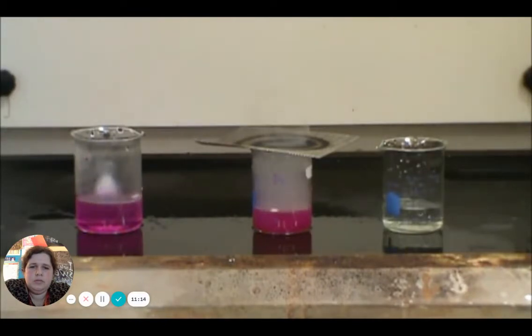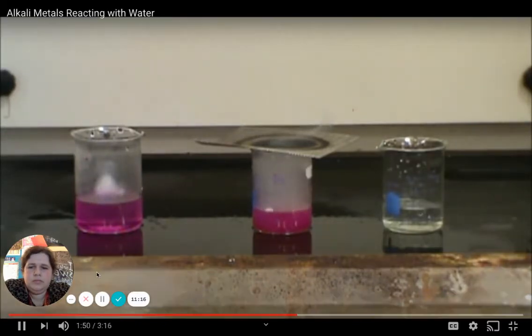And then the last one, I'm going to go ahead and put my 2 pieces of potassium in. That thing that he put on top of that beaker is basically to prevent stuff from flying out, but still to allow the gas to escape. I believe we call it wire gauze because it's got the pattern of gauze like we would put in a wound, but it's made out of iron so that it's heat resistant.